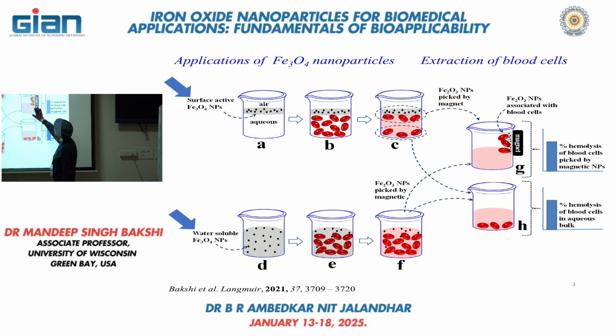While performing this extraction, you may break the blood cell and create a red color solution because of the oozing of the hemoglobin from the blood cell, and that creates the red color solution.